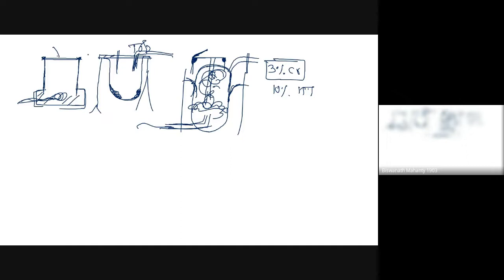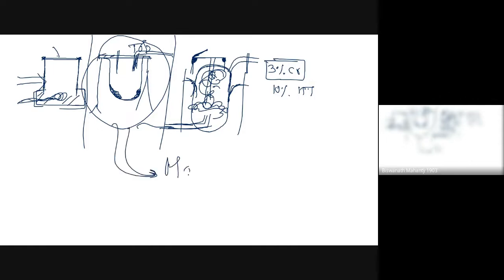Now if I ask you a few very simple questions, what design will I prefer? Semi-spherical at the end. What material will I prefer? Stainless steel. What is the advantage? High pressure sterilization. We can have big size, pressurization is possible. If I'm making glass, metal glass, this is not a good idea. It is costly also, because two metal plates make it costly, and this glass is in fact cheaper. So most labs will have these variants, in most research labs.